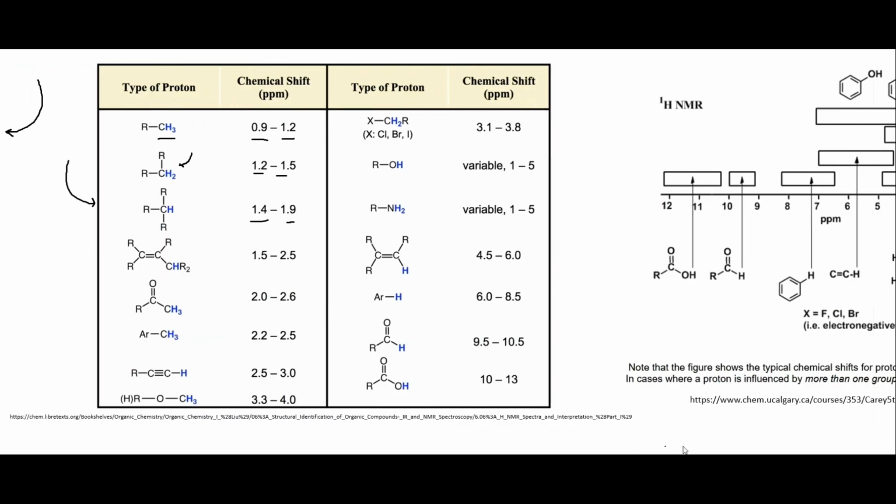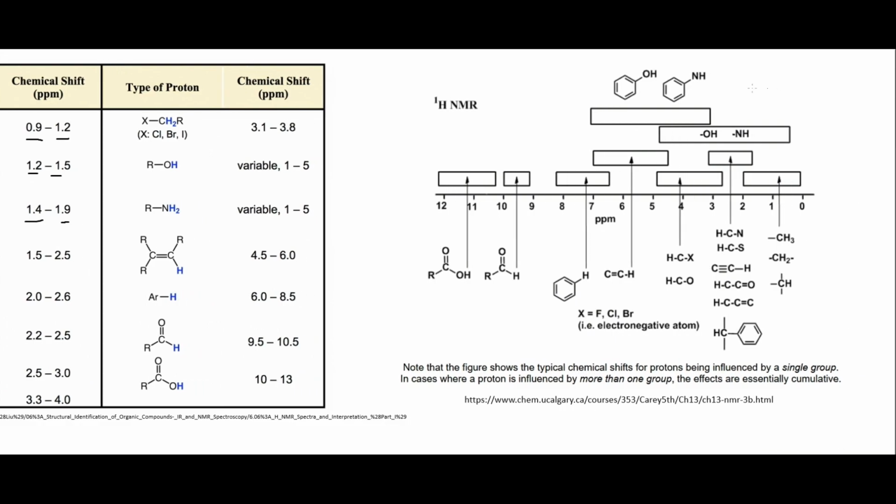You will often see tables that look like this as well. So this will actually show these ranges on here. This is saying that this phenol right here and this aniline right here can show up between about 7 and about 3 down here. Then this right here, X, is usually denoting a halogen, and we see this shows up between maybe 2.7 and maybe 4.9. Like I said, you will get different numbers for a lot of these, but they are usually within the same ballpark.